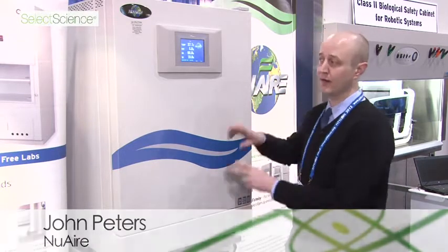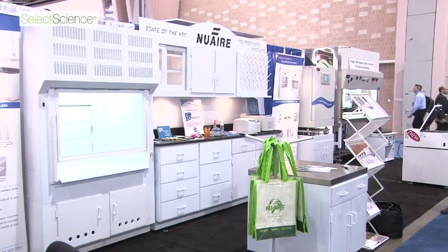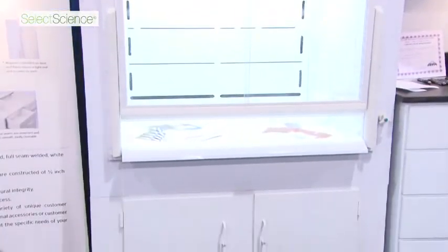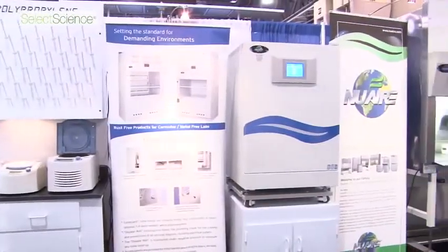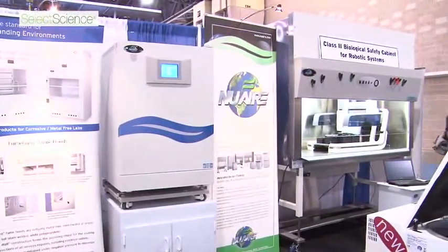I am John Peters, the marketing director here at Newair. Today we are exhibiting at PitCon, and we are showing our brand new CO2 incubator, as well as our lines of polypropylene casework and fume hoods — basically a plastic casework and fume hood for corrosive labs, anything really acidic, high chemical usage, as well as custom biological safety cabinets for liquid handlers or any large piece of machinery.